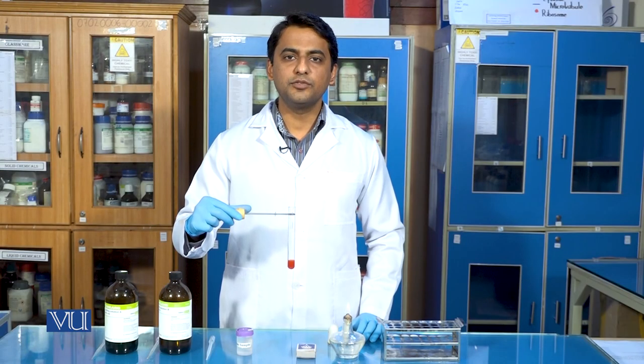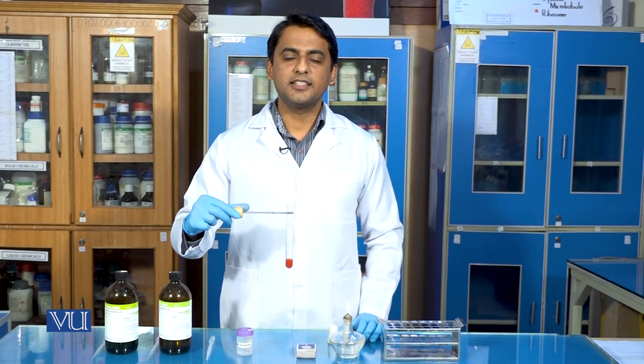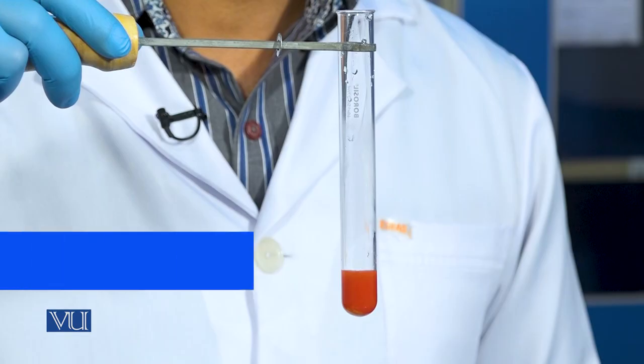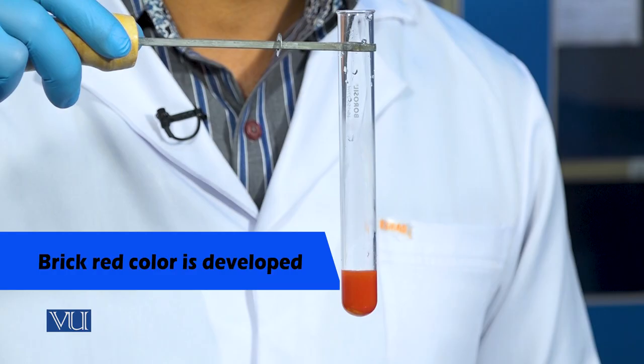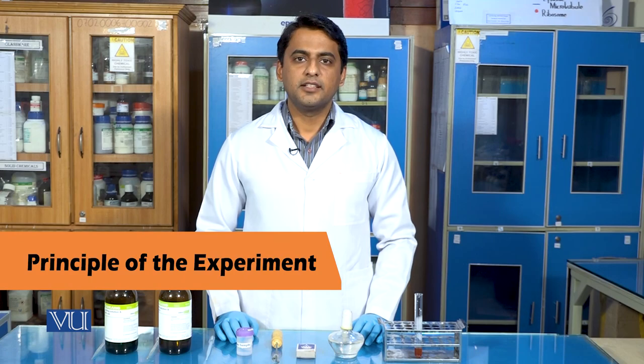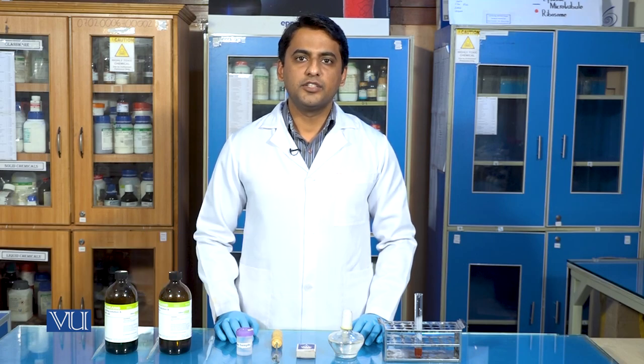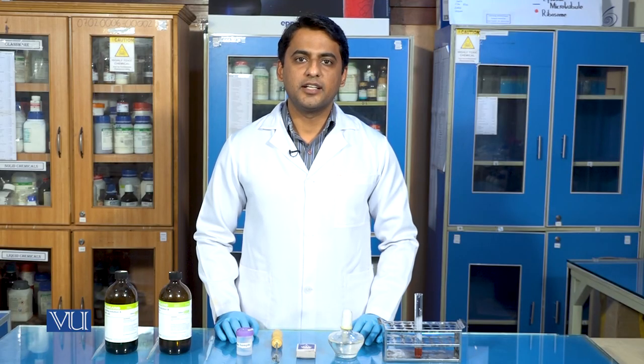So students, we can see that the blue color has turned into dark brick red color, which is the indication that glucose is present in urine sample. The principle of the experiment is that the cupric ions present in fehling solution on heating get converted into cuprous oxide, producing brick red color by the reducing agent sugar.